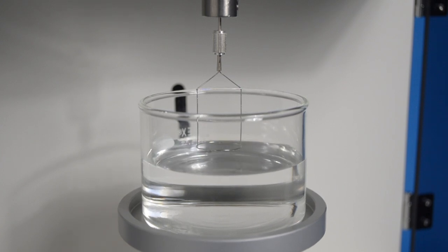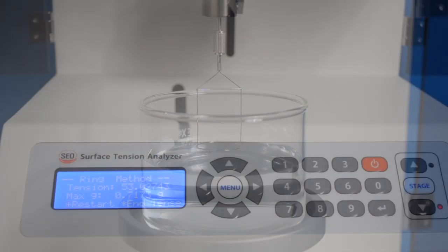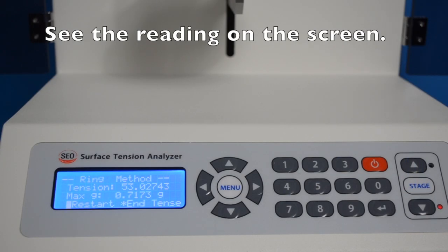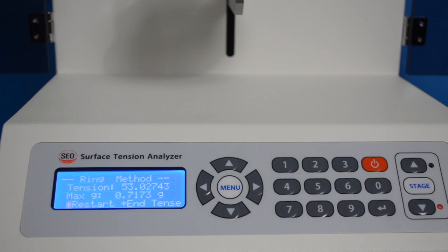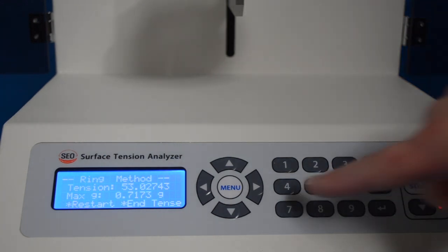At that point, the reading of surface tension can be seen on the screen.